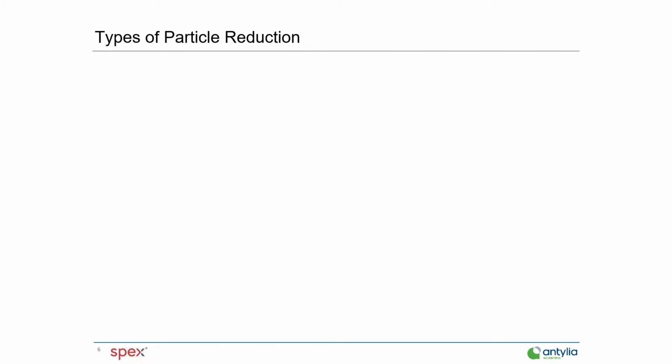Those physical forces are really going to determine what type of particle reduction you are going to need. There are four forces: compression force, which is two opposing forces coming down vertically on a material, and then you have it crushed in between those two opposing forces. You have a shearing force, like a scissor, where it actually just kind of cuts. This is things with blades.